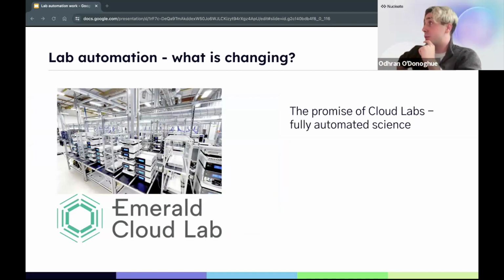An interesting example of this is the idea of cloud labs. These are a very novel thing. Emerald Cloud Labs is probably the furthest ahead. A few others are sort of beginning to take root. But the main idea here is that you try and automate everything and then make this automated lab available on the cloud to anyone who wants to use it. This is a very noble undertaking in terms of trying to get this all done. And one of the arguments of the advantage of this is that if all this data is centralized, you may learn how to do this better over time.